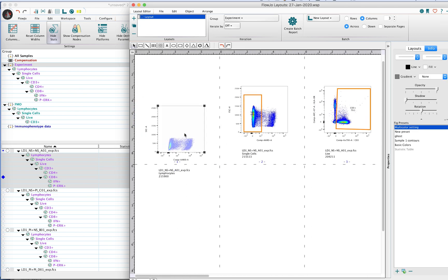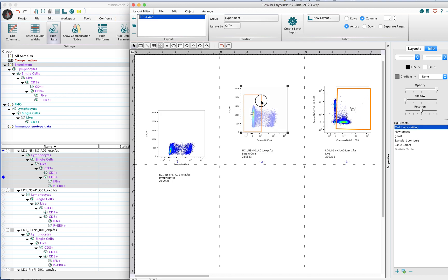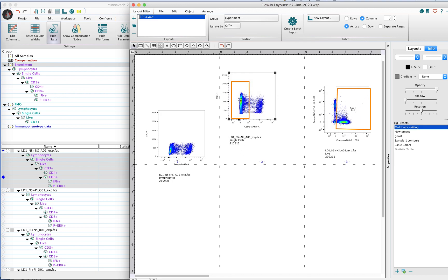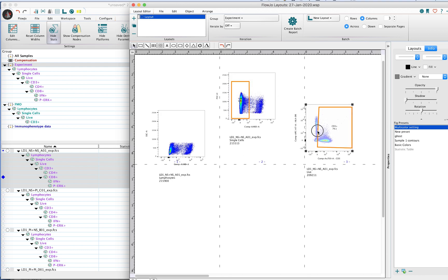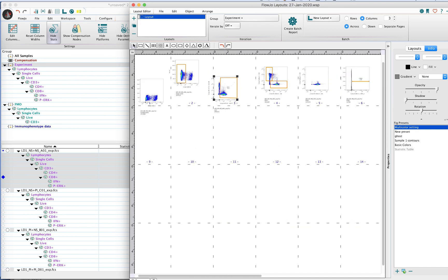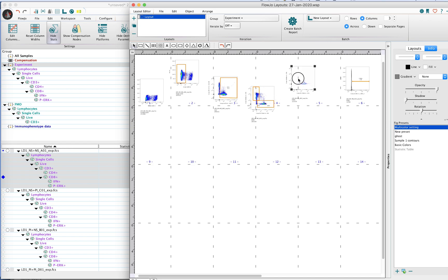However, when you start moving plots around, perhaps arranging them in an order that may make more sense for you in terms of a workflow, or you want to show progression of one cell type to another.